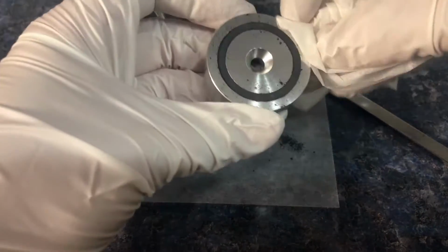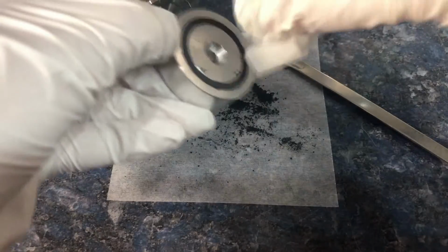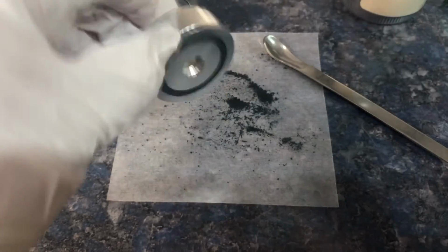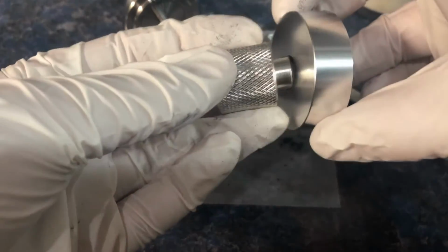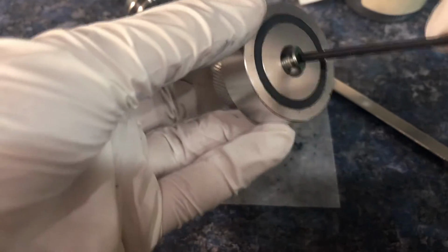Next, clean up the loose material on the sample spinner disc in order to prevent your sample from making a mess in the Raman sample chamber. Once your sample is cleaned up, put the knurled spinner adapter onto the spinner disc using a 2.5mm Allen key.